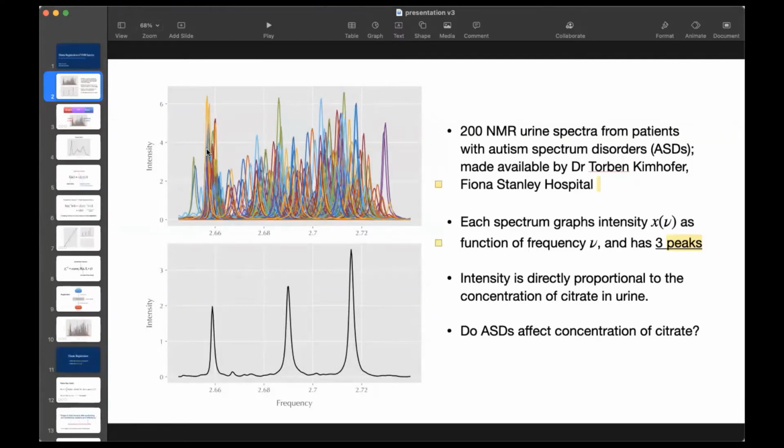If you look at the entire frequency range, each spectrum was measured at 28,000 points of frequency. And in fact, the data matrix was so wide that the registration algorithm wasn't able to complete. So the major pitfall of elastic registration is the extra computation time it takes to compute the shape mean. It seems to be lacking in that respect with respect to other registration methods.